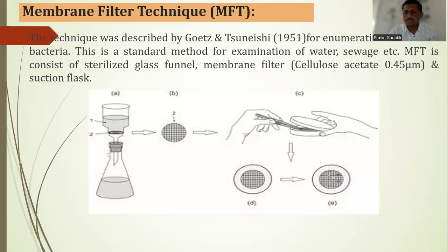The nutrients pass through the membrane and are assimilated by the growing cells. The number of coliform colonies developed on the selective medium indicates their number per unit volume of the water drawn through the filter. Dilution may be prepared for a much turbid water sample.